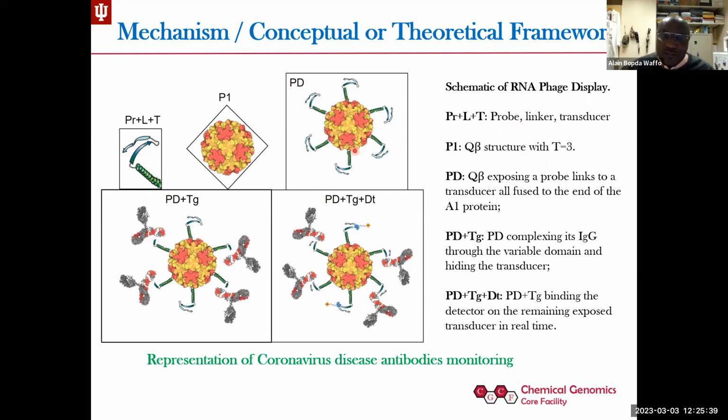And I will use this in just ELISA to know how many transducers can bind to the specific antibody or the target. I will count, and later I will have a competition between both, like you see here. So if I have antibody binding to these 4, and then you have those 2 still remaining, then I know what the total control looks like, and then what the subtraction will look like. And with this, we can easily monitor some of the protein.